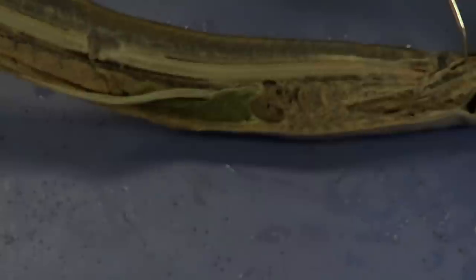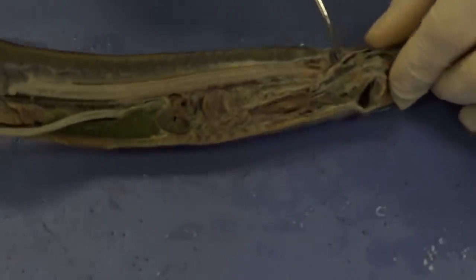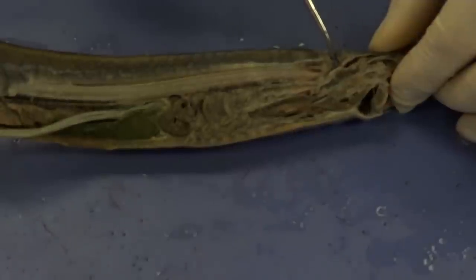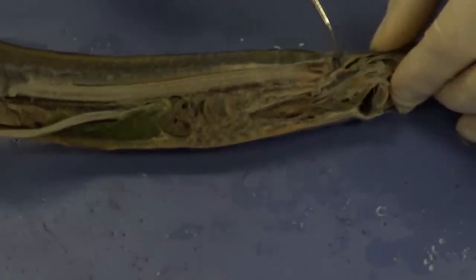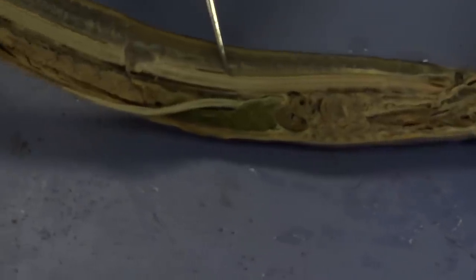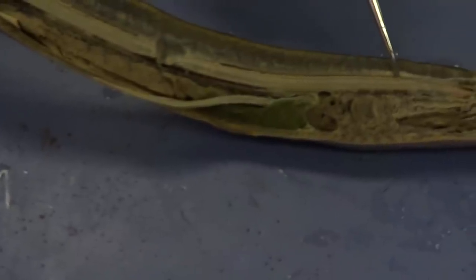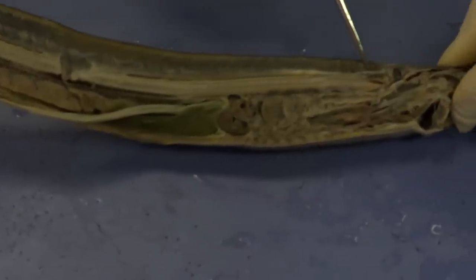Let's go back to the headward region — anterior. This is the external nostril right here. It comes in and ultimately ends in this black structure: the olfactory bulb or olfactory sac, which senses and processes information to allow the lamprey to smell. Just posterior to that, right here, we can see the brain. This whole structure is the brain, and then an extension — a continuation — of the brain all the way down is the spinal cord. In the larva, the immature form, this is going to be the dorsal hollow nerve cord, and as the lamprey matures, that dorsal hollow nerve cord gives rise to the brain and spinal cord.